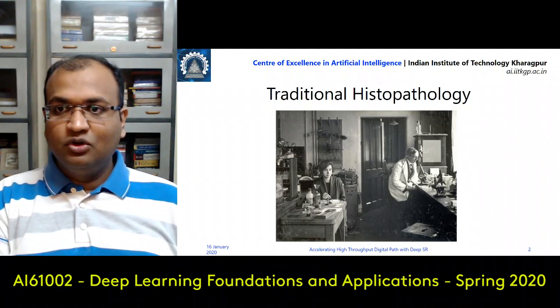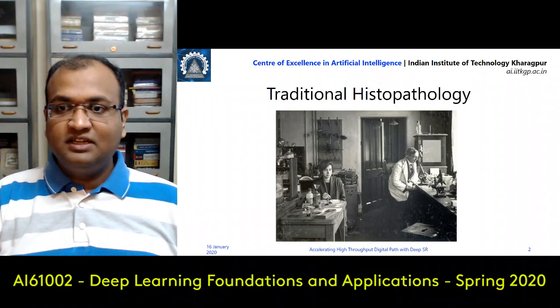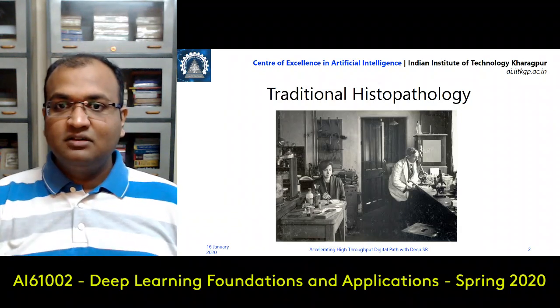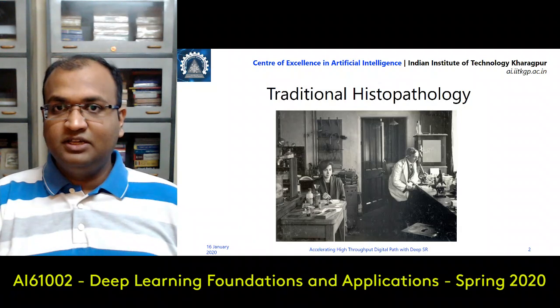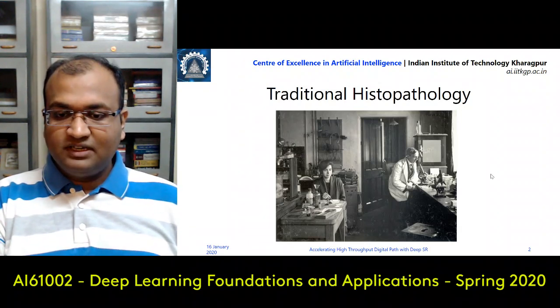Now, the whole point over here is essentially a term called resolution, and resolution is basically the smallest possible distance between two neighboring lines which you can discriminate. If you are not able to discriminate between the two lines, then there is no resolvability available for you. So as we go over here, we'll get into how that works.